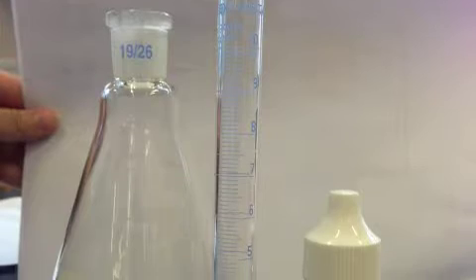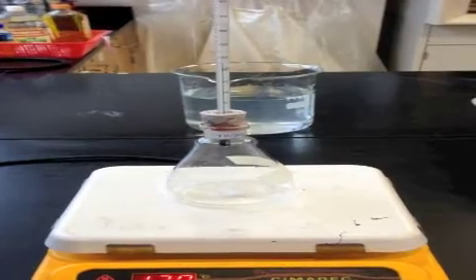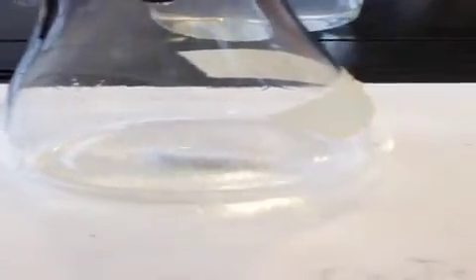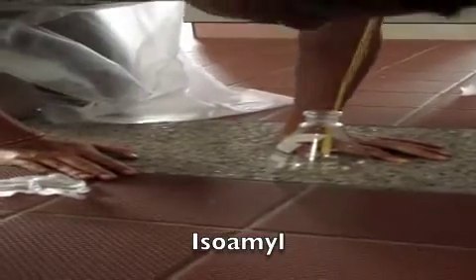To do this experiment, we used a graduated cylinder and we measured out 2 milliliters of an alcohol. Using another graduated cylinder, we measured out 3 milliliters of carboxylic acid. We then prepared a flask and added in the measured alcohol and carboxylic acid, along with a magnetic stirring bar inside the flask. We then carefully added in 10 drops of sulfuric acid and then wrapped paraffin film around the opening of the flask to prevent the smell from leaking into the classroom.